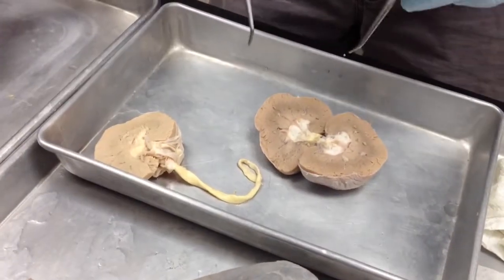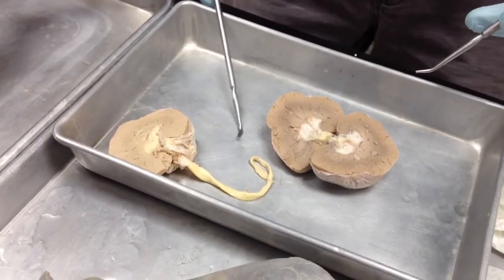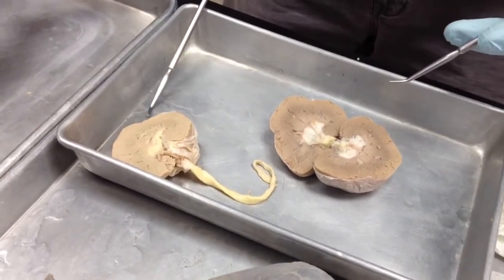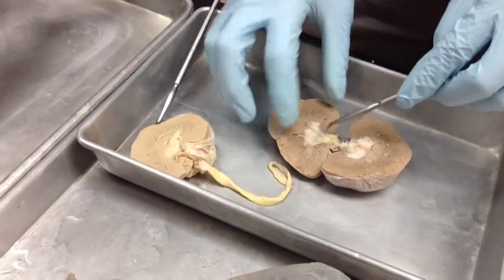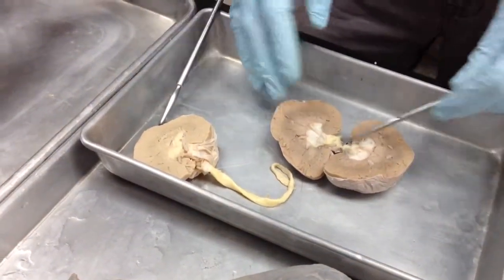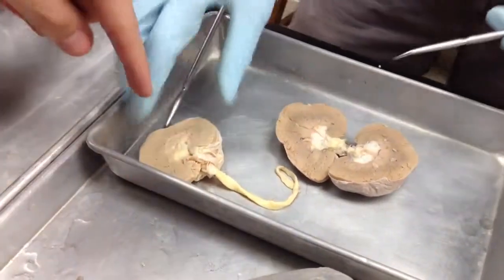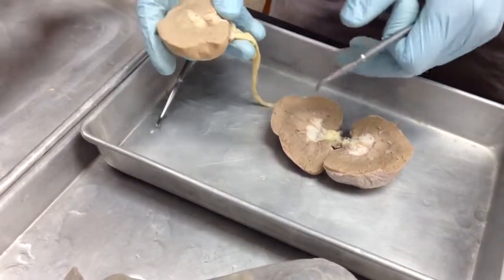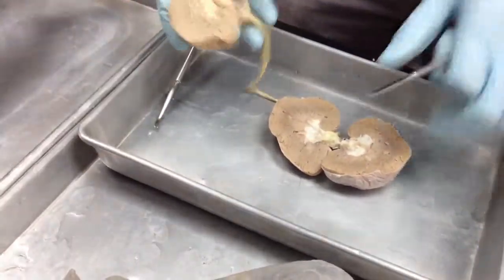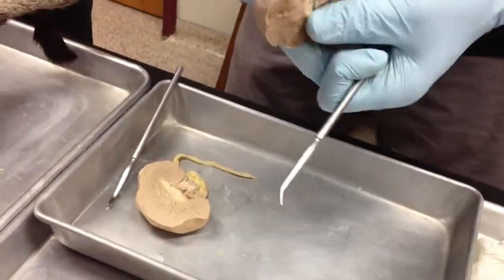Does that make sense? So is this just that, except it's connected to the bottom of it? So it filters through the white in the middle. Well, this is more of a collecting area. Is that what you're talking about? I'm just saying this is the same as that. Yeah, it all filters in the middle and then comes out. That's just showing us what the tube is, versus that's a better example. Yeah, the same guys.